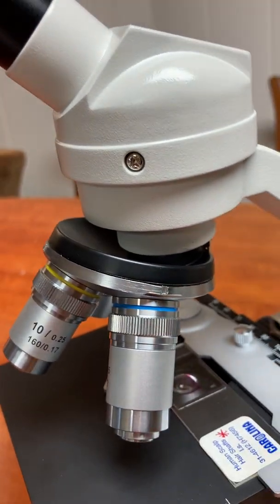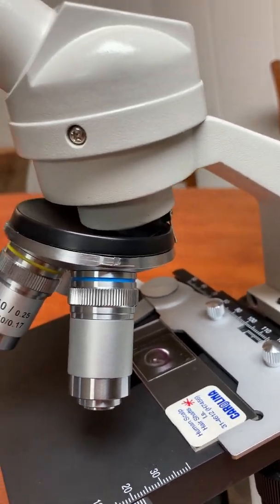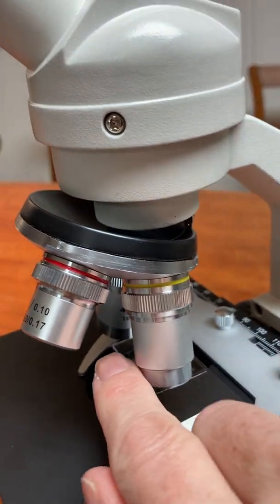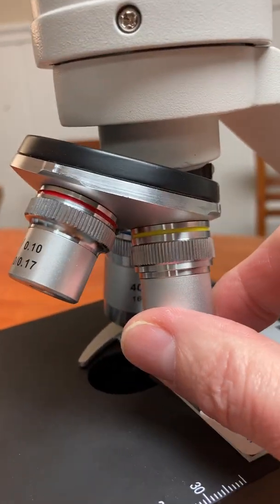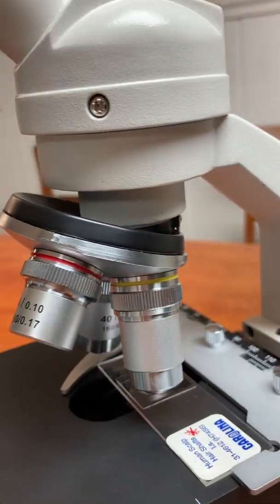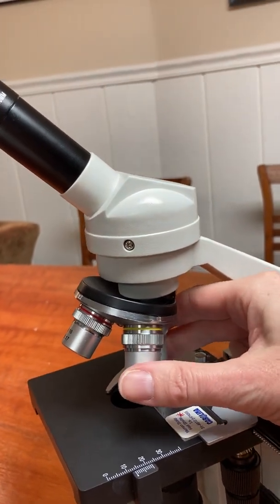And then this blue objective is the tallest and it's the strongest objective that we have. It's called the high power and it has a 40 on it because it magnifies 40 times. It's hard to see. There it is. In person, it's a lot easier to see these numbers than it is with me filming this with my left hand when I'm right handed.